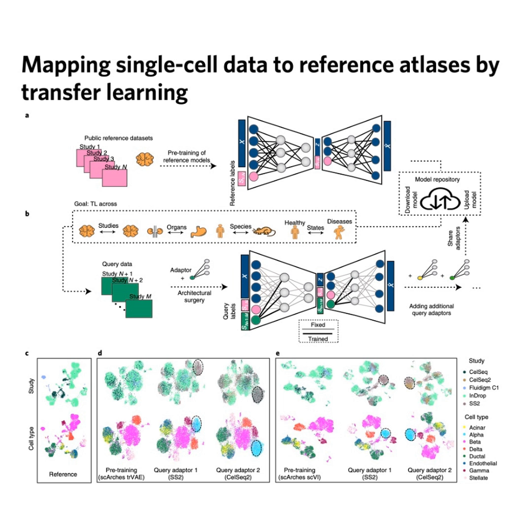Right, and there are a couple of huge reasons why. The first is just the raw computational power required. Yeah, you can't just download the whole Human Cell Atlas and run it on your laptop. You need the expertise and the hardware to rerun this gigantic, complicated integration pipeline with millions of cells just to see where your, say, 5,000 cells fit in. And that's before you even get to the stickiest problem in all of single-cell biology, the batch effect.